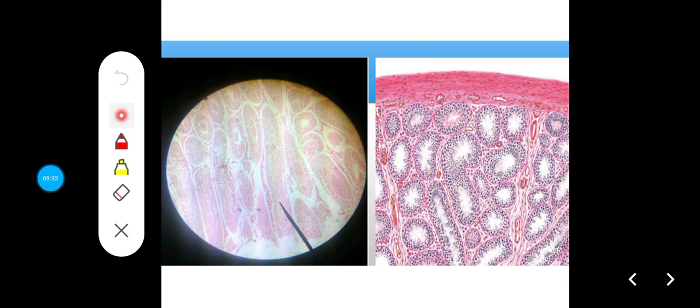So the tunica albuginea is visible at this point. The tunica albuginea. Then the interstitial cells, which are in between the seminiferous tubules. And you can find a few blood vessels as well. Now the tubules contain different layers of cells at varying levels of development.